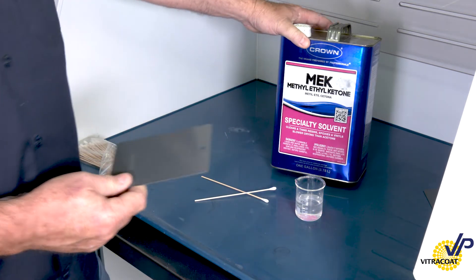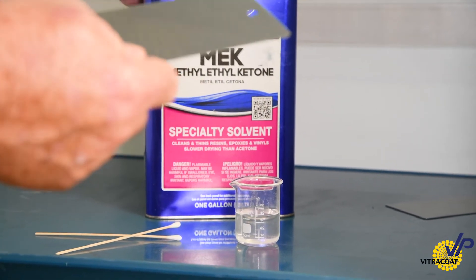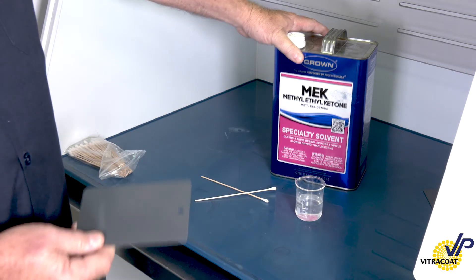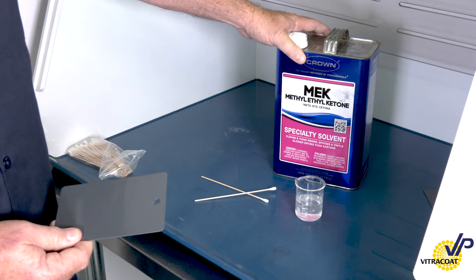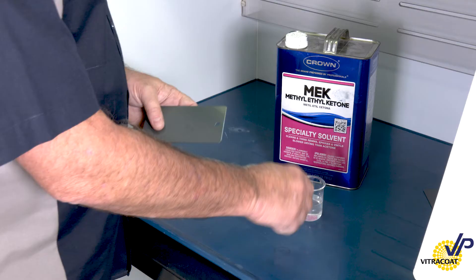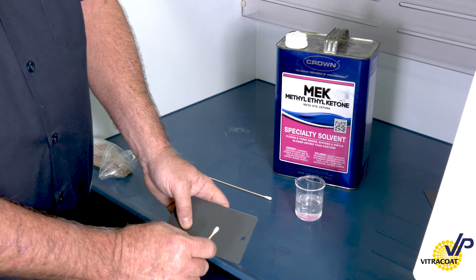What I'm going to do is take methyl ethyl ketone — it's a very harsh solvent. Some organizations may use a toluene or acetone mix, but we're going to use MEK for this test. The test involves submerging a q-tip into the solvent and then doing 25 double rubs.